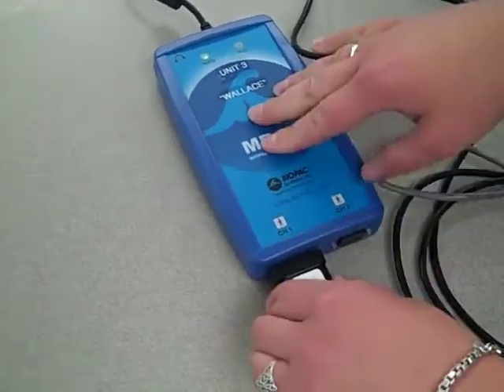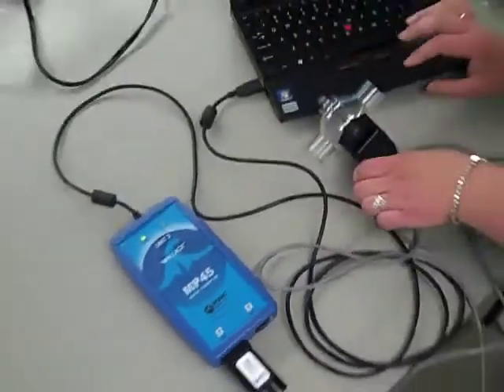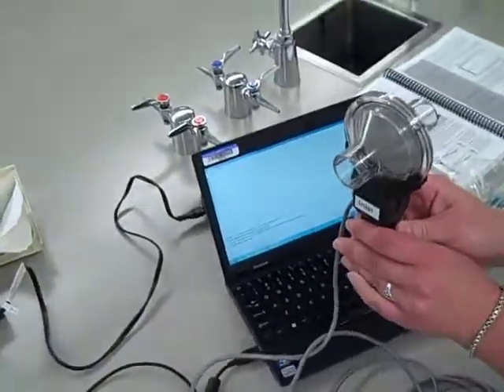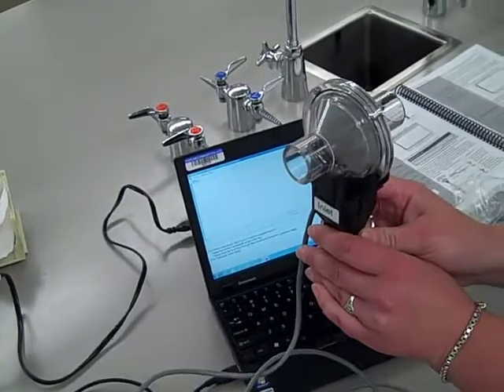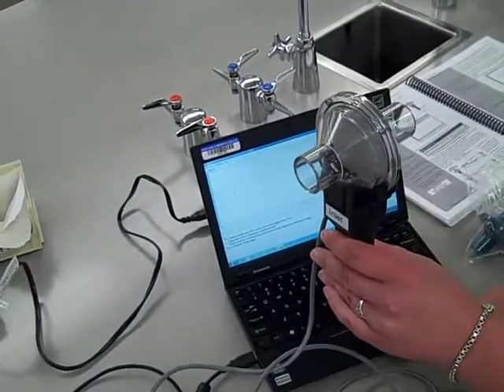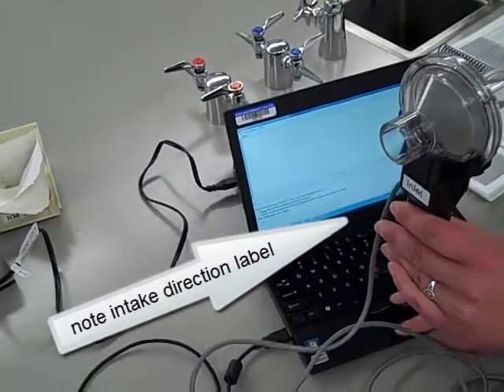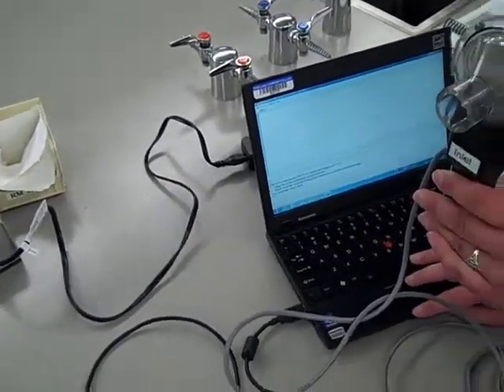Not too tight, but firm. And then before you calibrate, you have to have the transducer upright, because that's a position you're going to use when you're breathing in and out, when you want to get a baseline reading. So then you'll hold it upright, steady, and try not to move it at all.